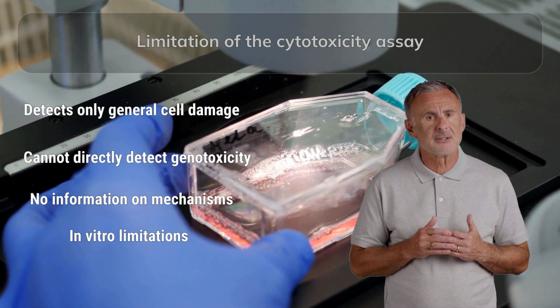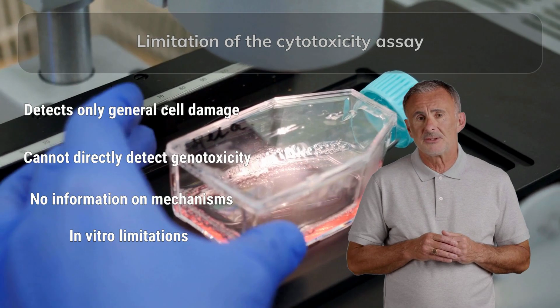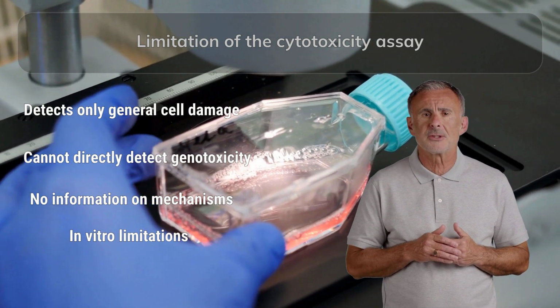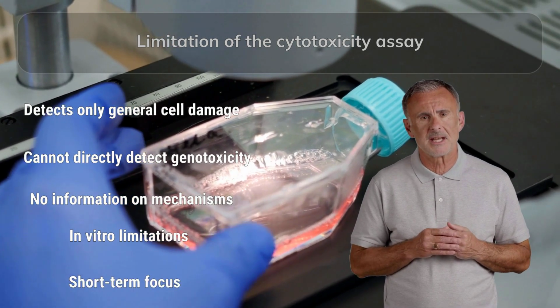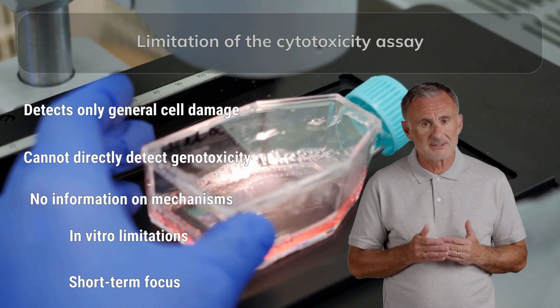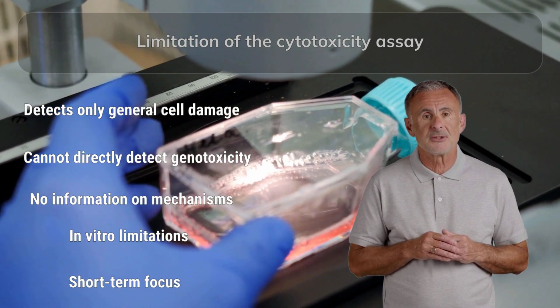In vitro limitations: cytotoxicity tests are performed under controlled lab conditions that may not reflect real in vivo exposure, e.g., metabolism, immune responses. Short-term focus. These tests capture acute effects, but not long-term effects like chronic inflammation, carcinogenesis, or reproductive toxicity.